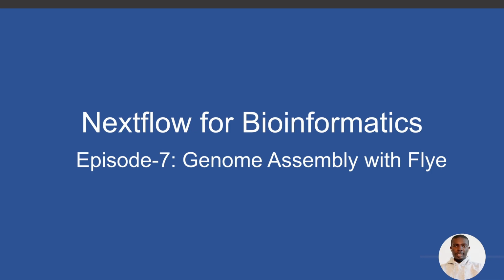Now, for those who don't know, Flye is a tool that is used to assemble long-read data. So you can use it to assemble Oxford Nanopore data. You can also use it to assemble PacBio data.